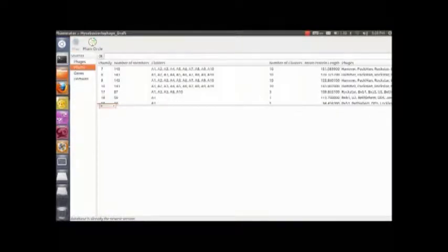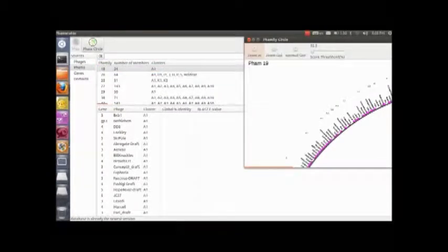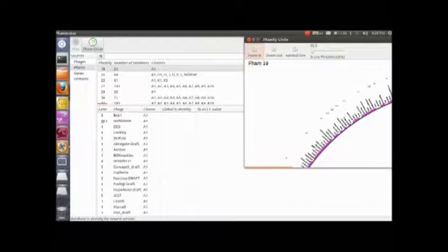Then, I'm going to choose Family 19 for no apparent reason. Then, open up your Fam Circle.